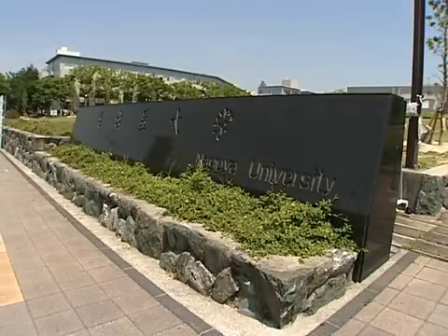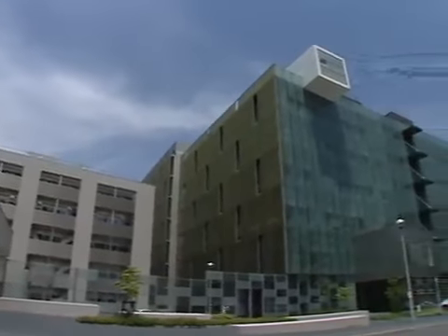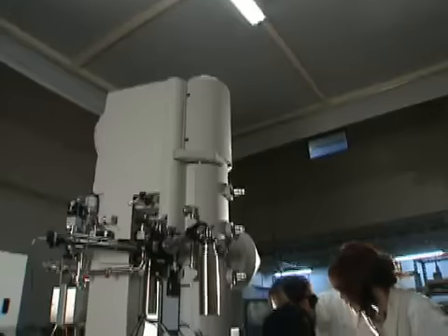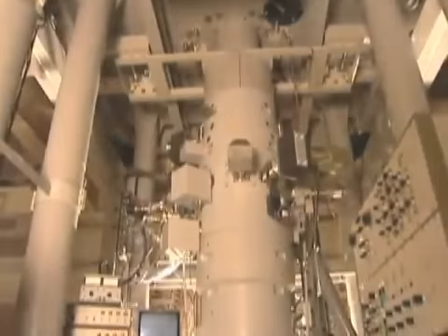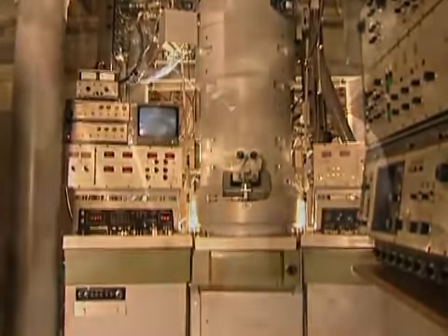Don't worry. Nagoya University has one of the greatest electron microscope laboratories in the world. Installed are 2 high-voltage electron microscopes and many others of highest quality. In this laboratory, top-level electron microscopists are performing cutting-edge researches. They will answer your questions. Let me introduce those microscopes that are open to your usage.